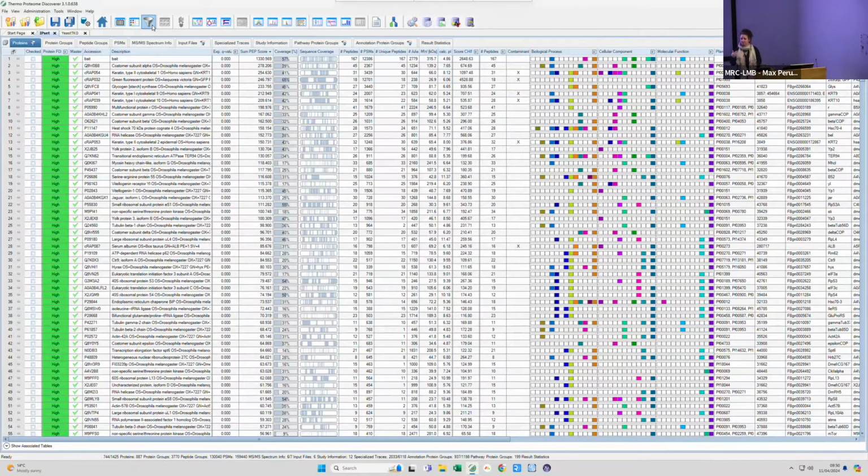It will do a customized analysis to your sample. So you can just come to us with questions, and we will run the pipelines for you, not on PD, potentially on R or whatever pipelines this new person is going to implement. Anyway, IPs. IPs are slightly different, right?